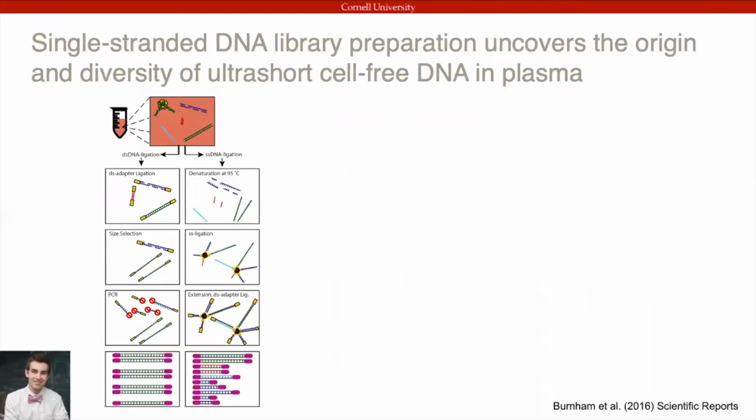Conventional DNA library preparation relies on double-stranded adapter ligation, on the left, where double-stranded adapters are ligated onto the ends of DNA. And using bead-based size selection and PCR, we eventually end up with a DNA library. In 2016, Ryan Burnham, a graduate of the lab, had a new idea that was inspired by genomic analyses of ancient DNA. And he proposed a single-stranded DNA library preparation method.